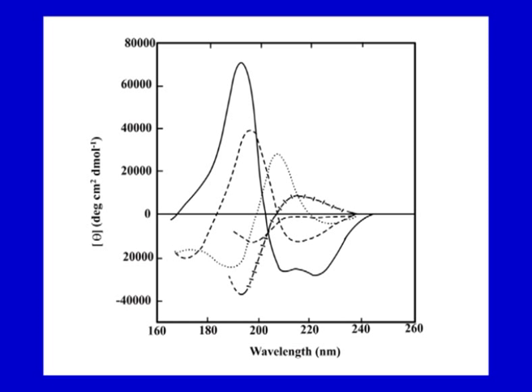So, these are different patterns. If you have a protein molecule and you are observing it in CD spectroscopy, there are clearly signature patterns available. For alpha helix there are very clear negative peaks at 208 or 209 and 222 nanometers. For beta sheet it is not so clear, but still at 218 nanometer, and then others are there for 310 or random coil structures. The dotted line is more of a beta turn type of structure. So, these are indicative of the kinds of structures contained in a protein molecule.